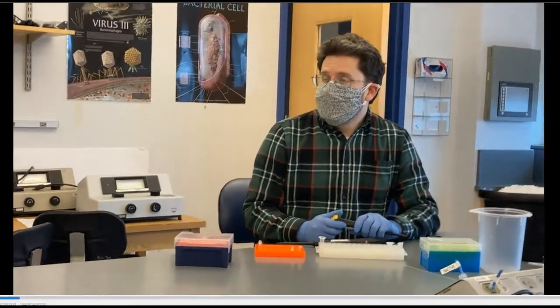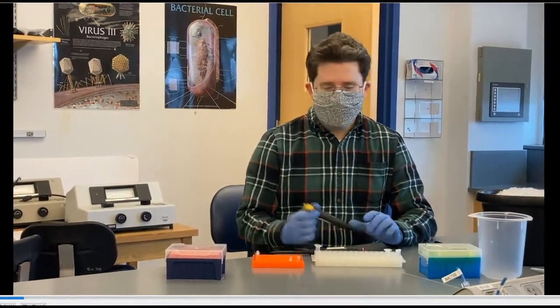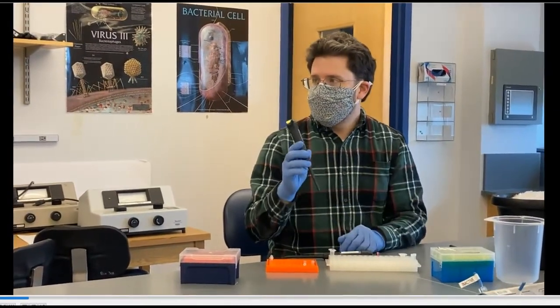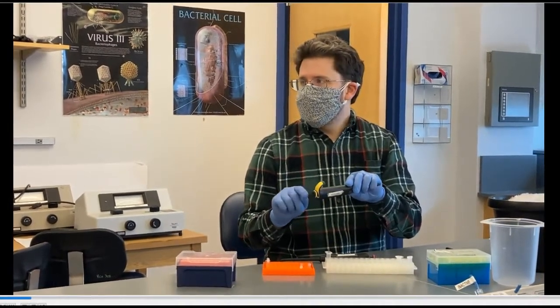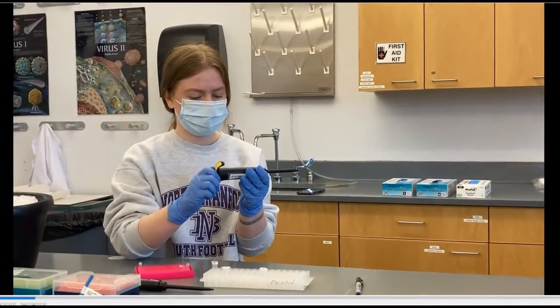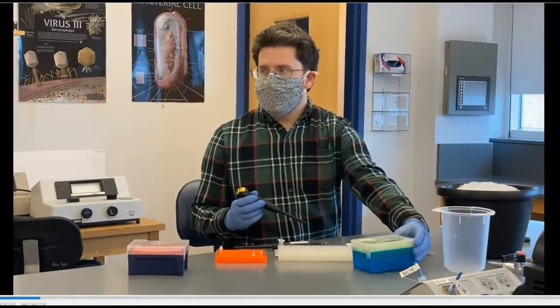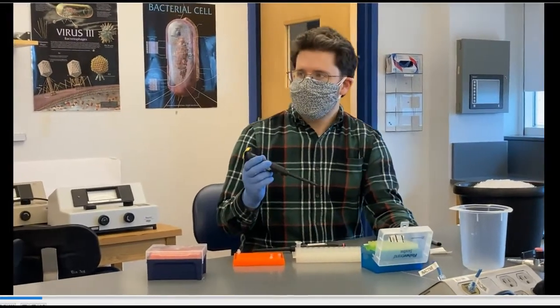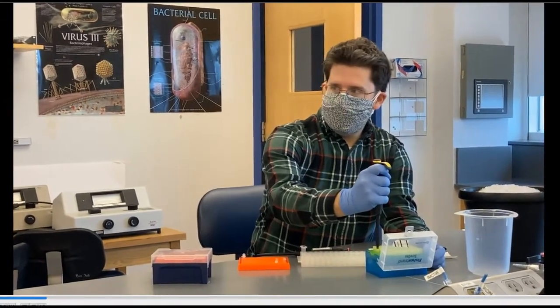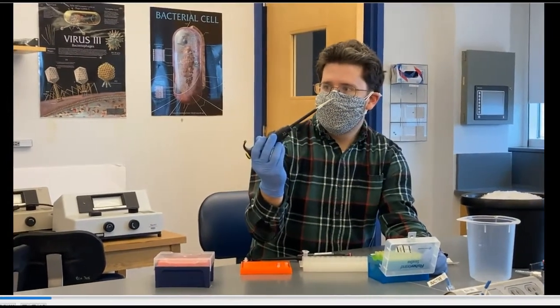We're going to start adding the reagents for the PCR reaction. I always begin with the water, just because we don't have to switch tips in between. Take the yellow micropipetter and dial it down so it reads 22. Then open the yellow box of tips, line up the tip, and put it on using a little bit of force — bang it like twice and it should be on.